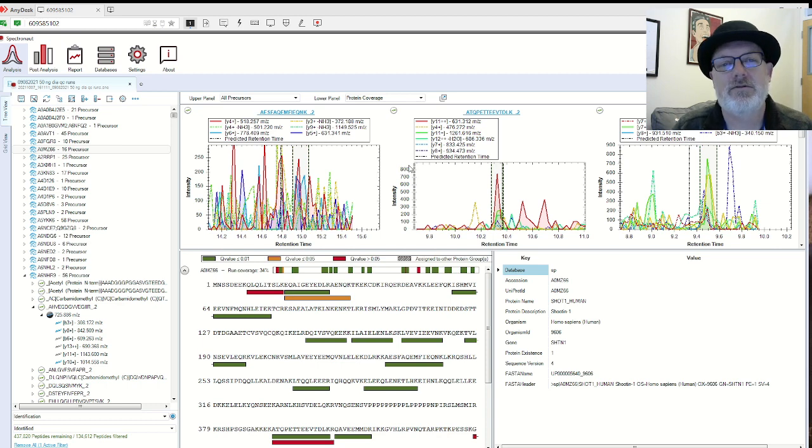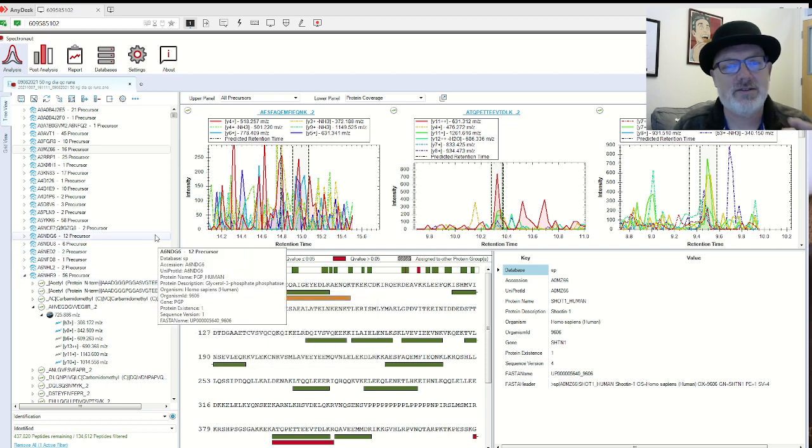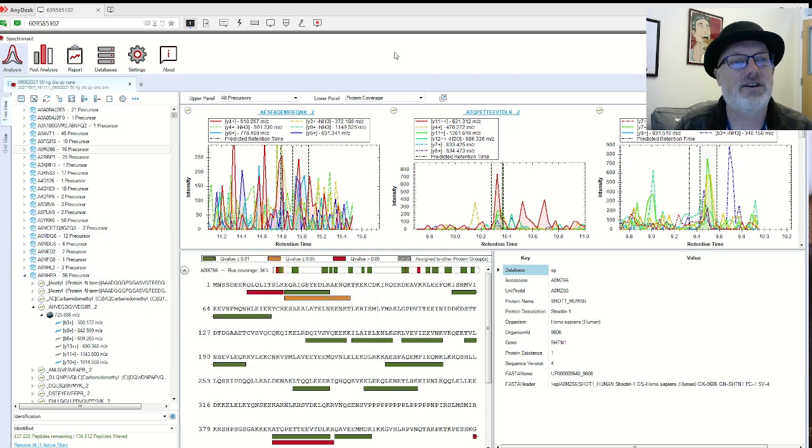Again, it's 50-50 whether we return these data files to people. For example, just yesterday, someone was asking me about Spectronaut and the data files, and it was like 5 or 6 or 7 runs, and it was like 30 gigabytes. So sometimes we don't do it, but like we say, we're really happy for you to have them. If you want them, please ask, and we will be happy to give them to you.